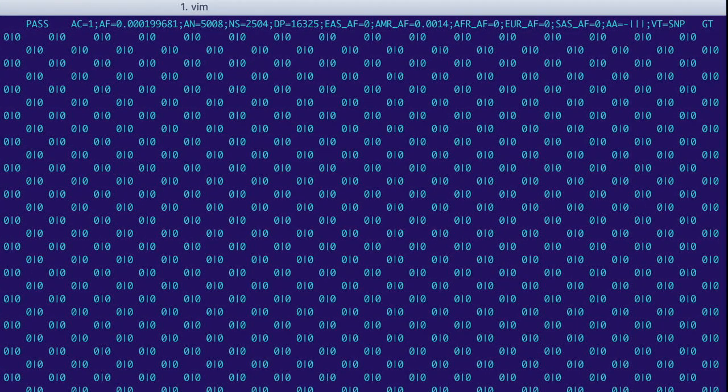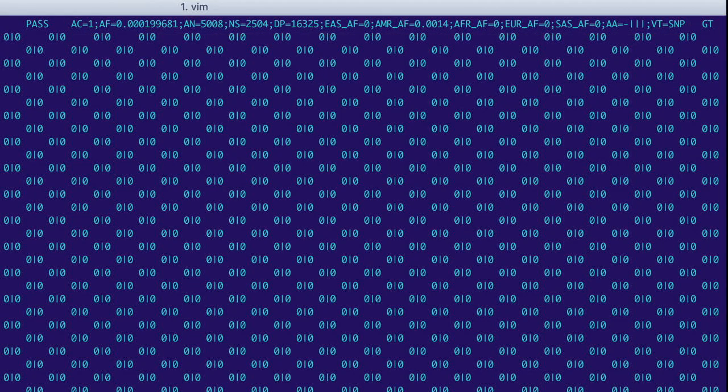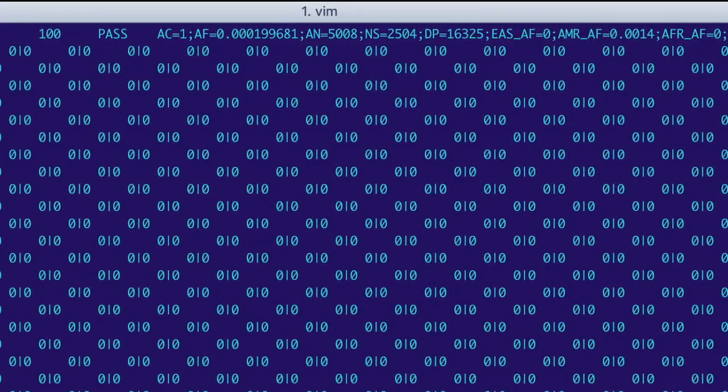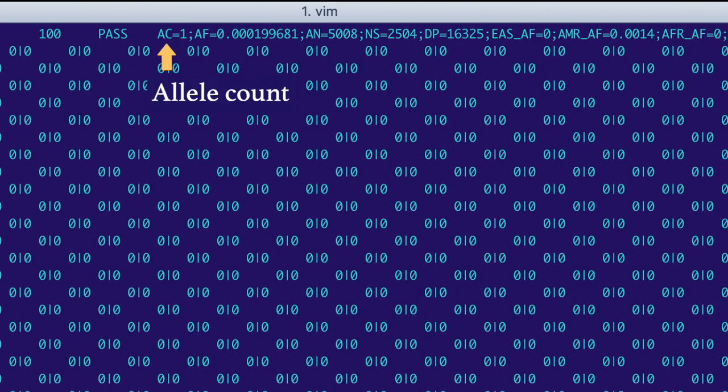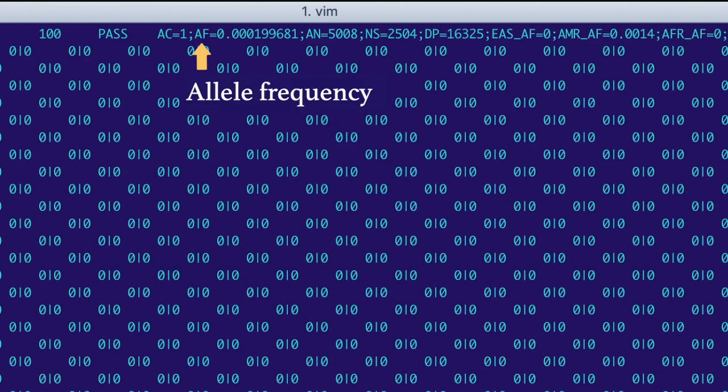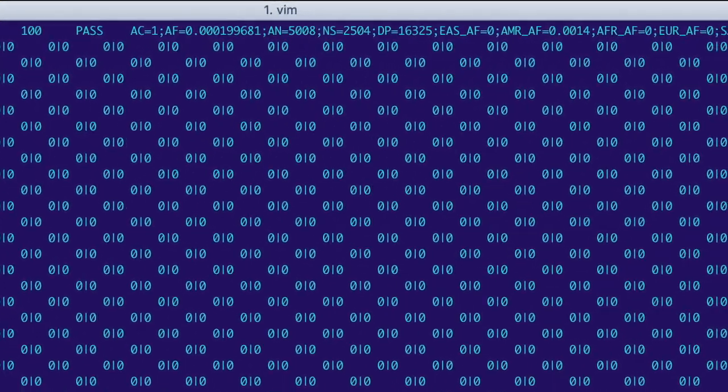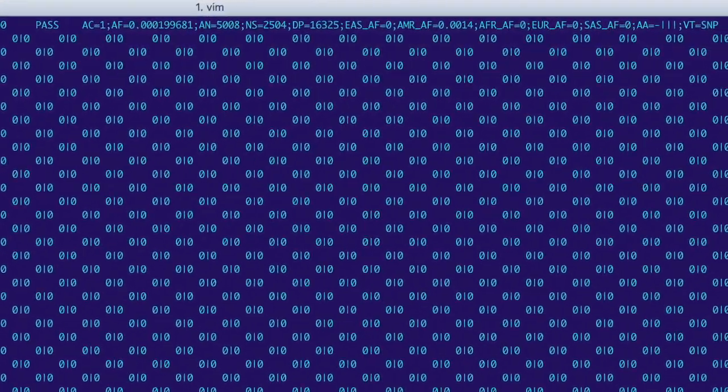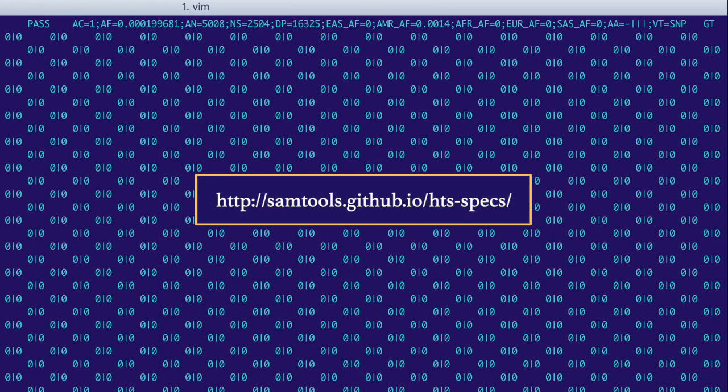Now all of this information here is in the info column, and it's made up of key value pairs separated by semicolons that summarize the data for this variant in some way. The first key, AC, stands for allele count, and it's the total number of alternate alleles across all the samples. The next key, AF, stands for allele frequency, which is how often the alternate allele occurs. The source of the allele frequency data can vary depending on how the VCF was annotated. If you want to know more about these key value pairs or the VCF format in general, check out this VCF specification.